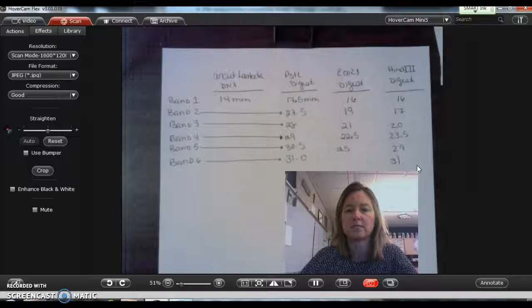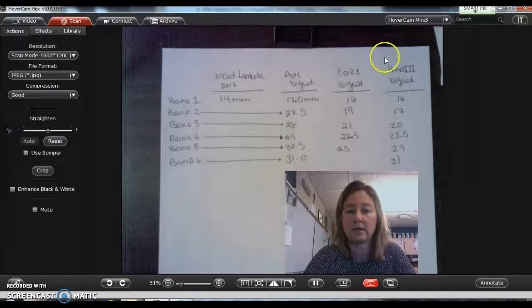You go ahead and copy this down into your second data table. The first data table should be your information. Please label that as your information. The second data table should be the sample data. And so you will graph that and estimate the base pair lengths based on all of these distances traveled.